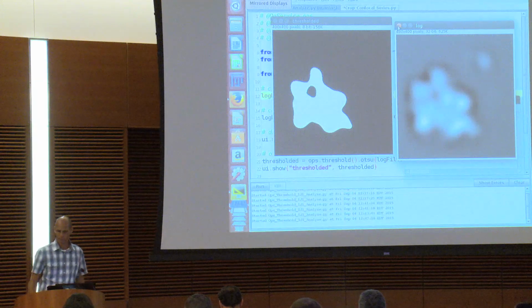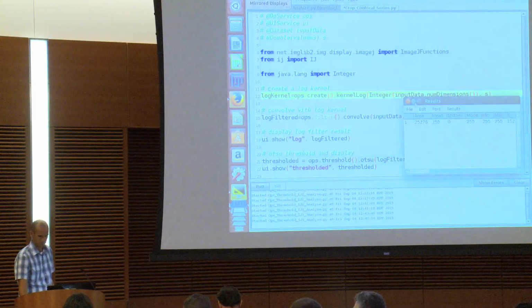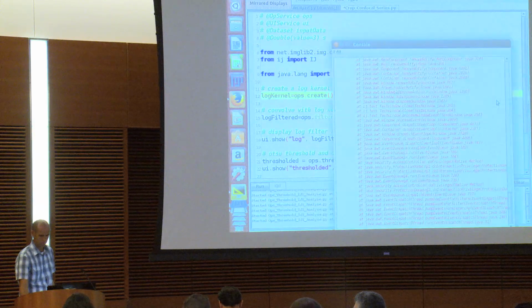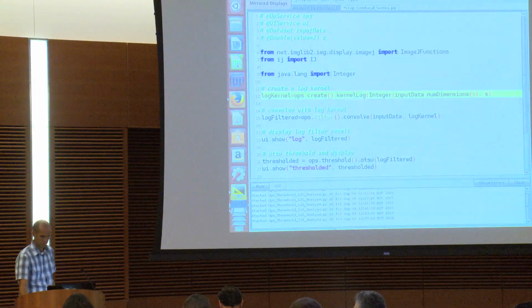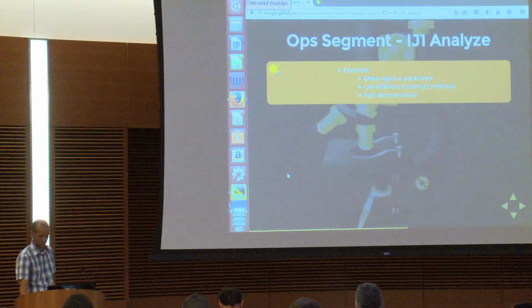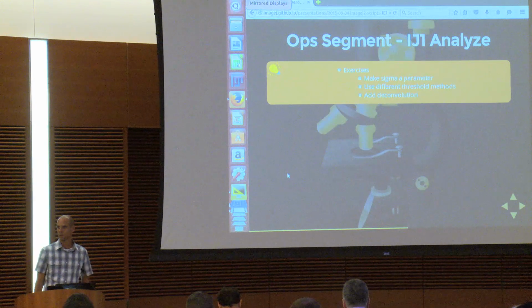So at the moment, I would recommend still using their file. Another way of doing it would be to write a second script and call that script from the first script. Ideas there are also welcome.